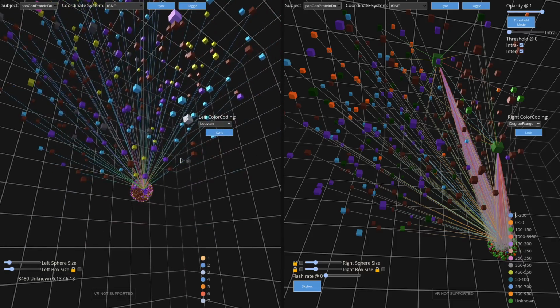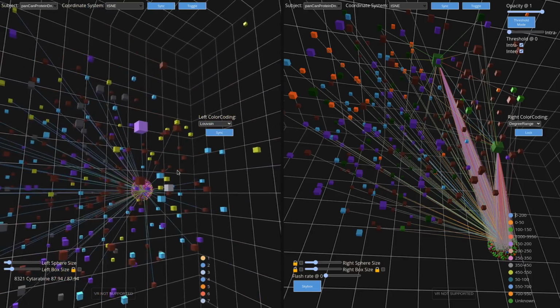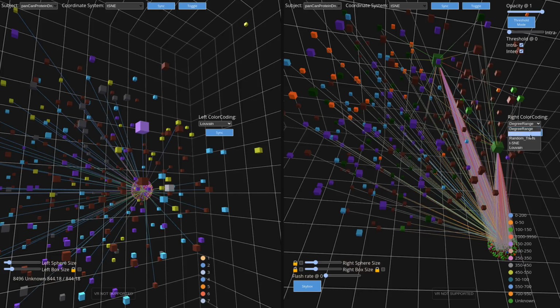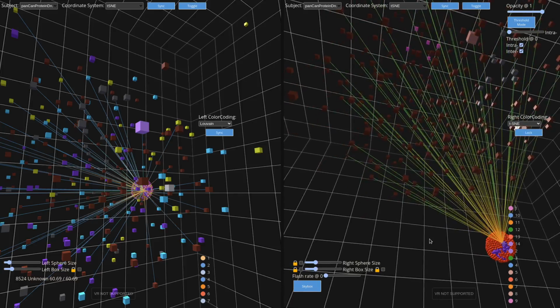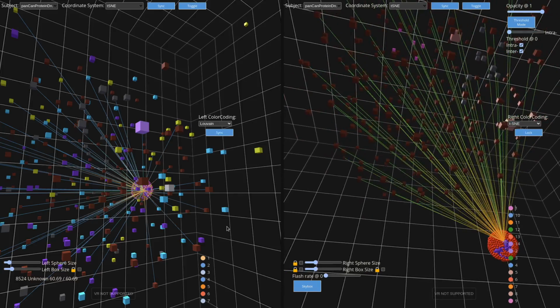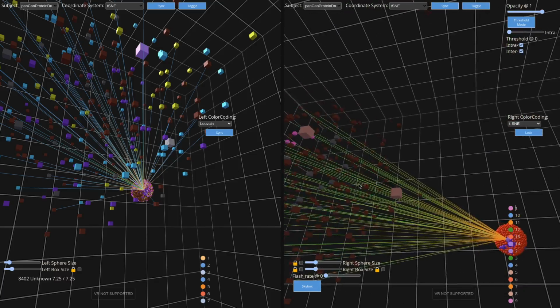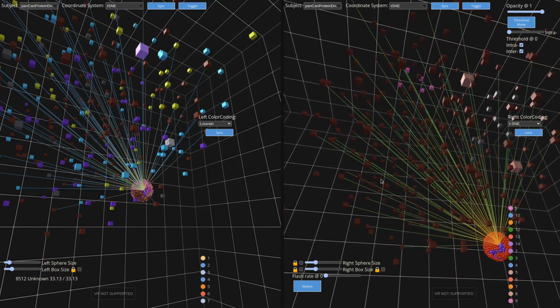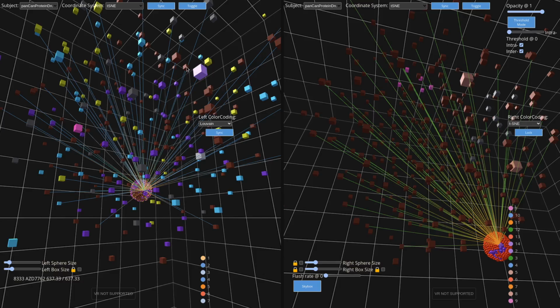independently of the coordinate system. So you can see how those overlap. If you have the native t-SNE on one side and, say, Louvain on the left, and then t-SNE on the right, you can see how the drug networks and the clusterings overlap.